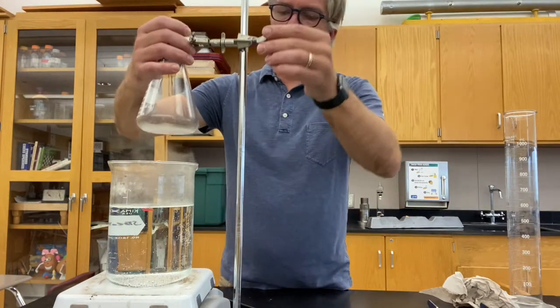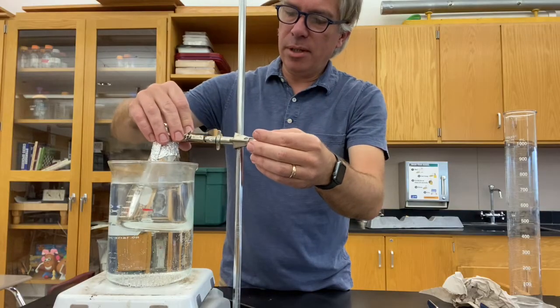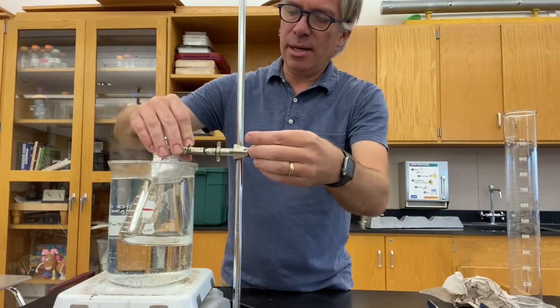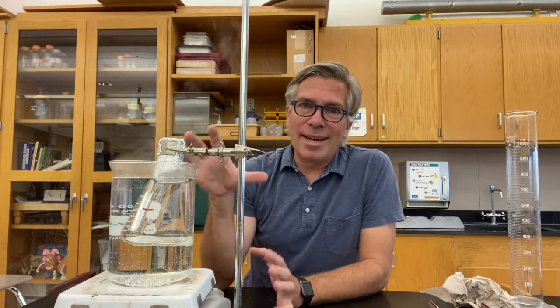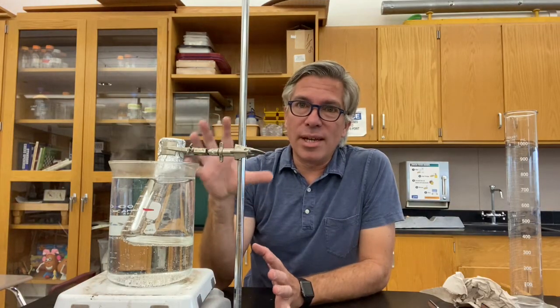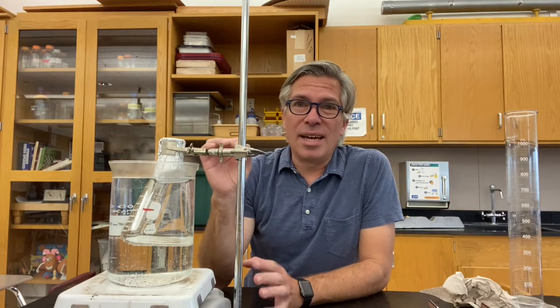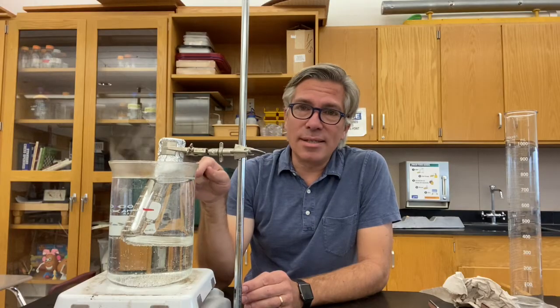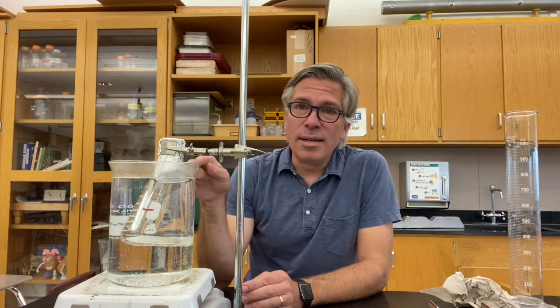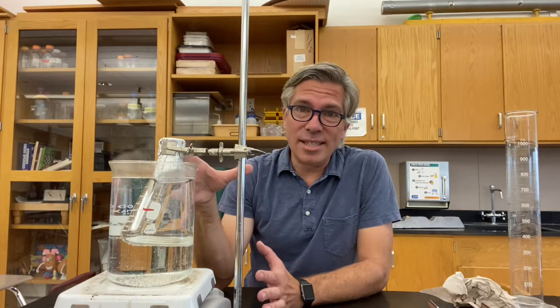Next, I'm going to lower it into the water bath where the heat from the boiling water is going to help my volatile liquid vaporize. And here's the tricky part. I've got to let it go until the liquid has just completely evaporated, but not any longer than that. And this is hard because the liquid is clear and it's inside a glass container, inside a clear liquid, inside another glass container, and it's really hard to see it sometimes.